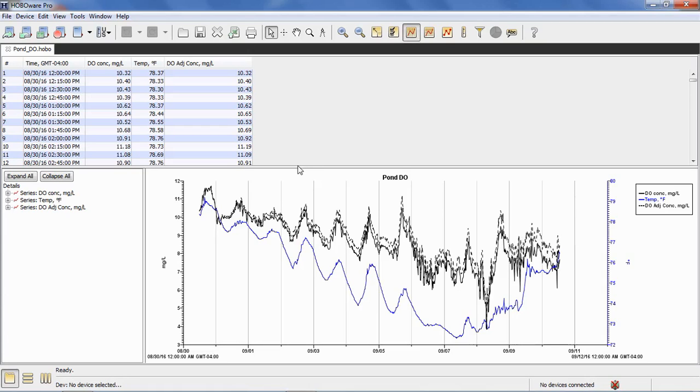So doing that field calibration corrected for that fouling. And when we pulled the logger out, we cleaned it and we put it back in. We left the loggers logging. We'll read them out in another couple of months to see how our long-term data was. But for right now, this is just an interim readout, to make sure everything's working okay.